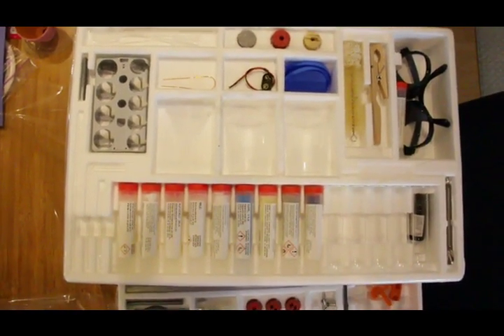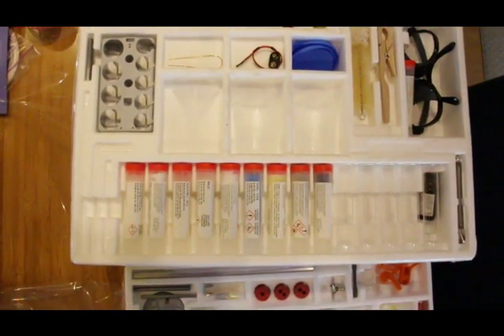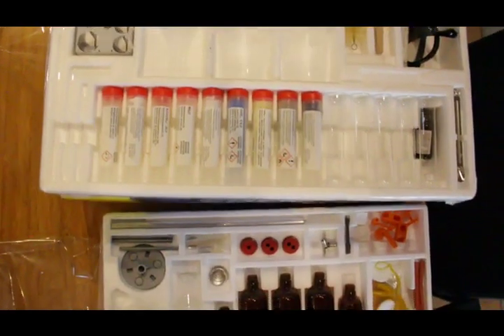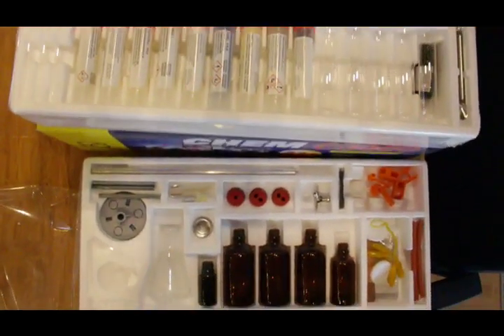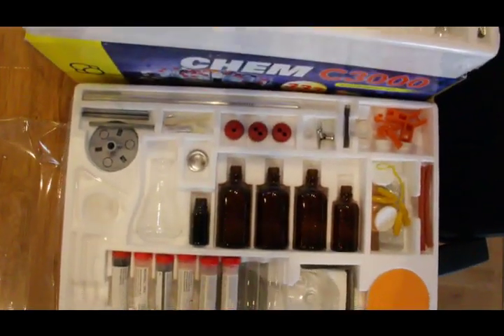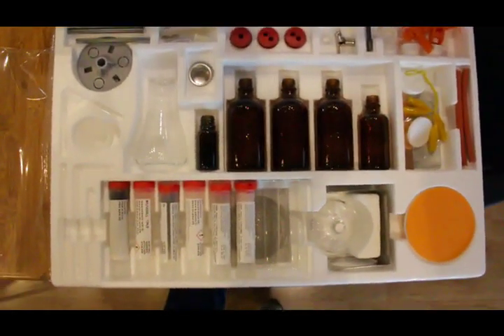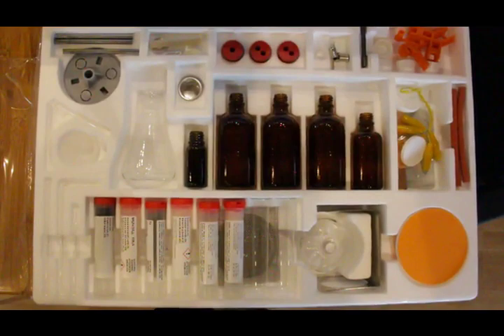This is the Thames & Cosmos Chem C3000 kit. There are lots of pieces in it and today we will be assembling the alcohol burner.